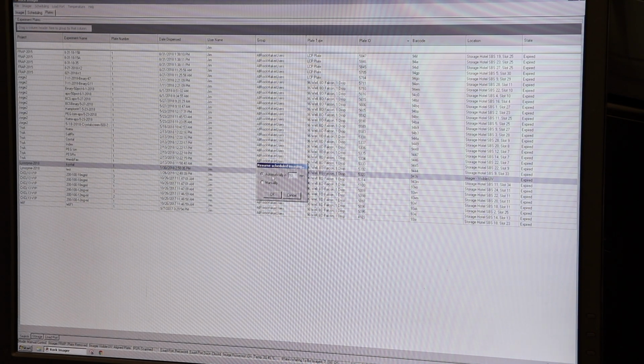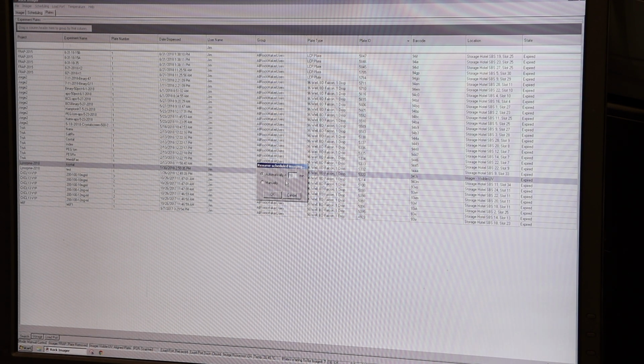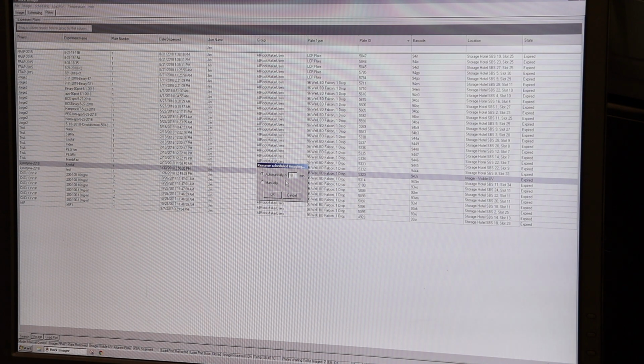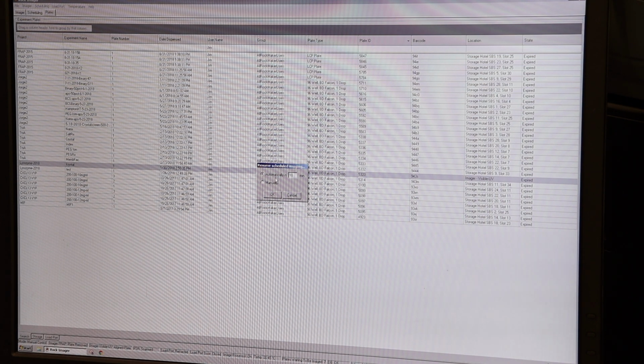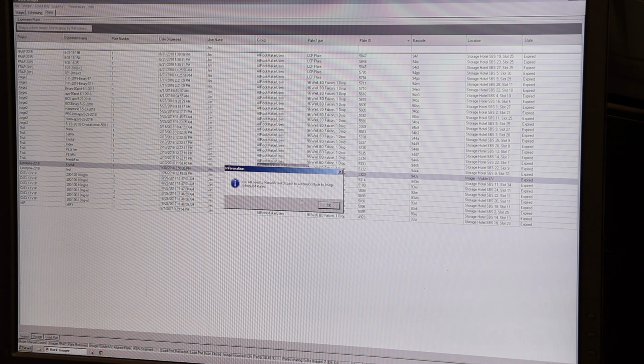You're better off leaving it at Resume automatically in 10 minutes in case you forget to set it back. That way you don't disable it for the rest of the day if no one sets it back. I'm just going to switch it to manually right now, though. That'll allow you to use it.